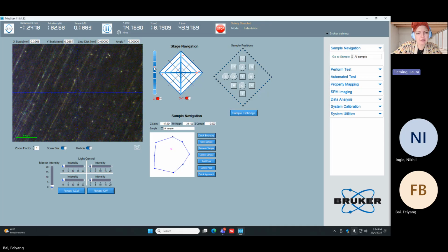Okay, so I think we are going to have to redefine the sample zone if it's that out of focus when we try to right click. Because what are we at right now? 439696. Do you see that up? I'm sorry, I'm going to request control again so I can point.